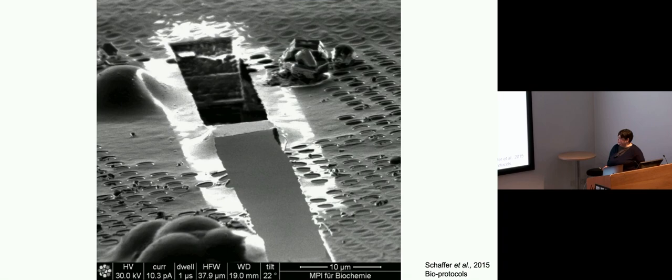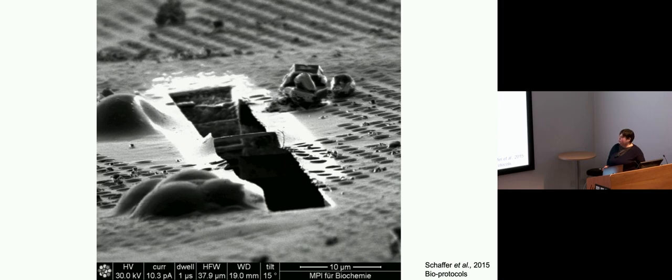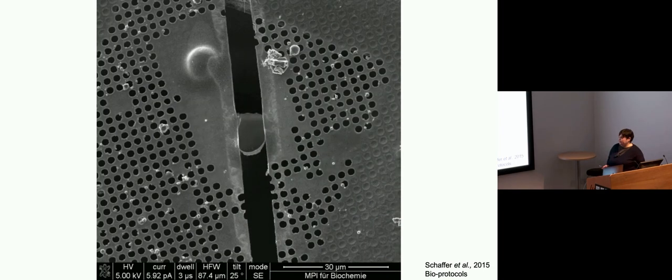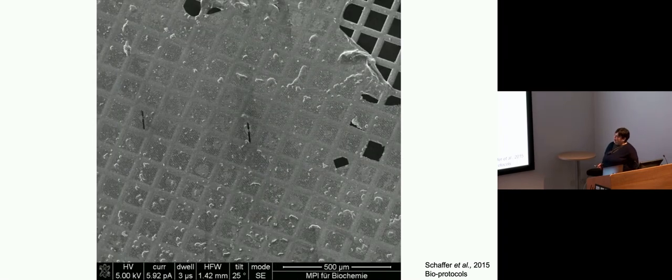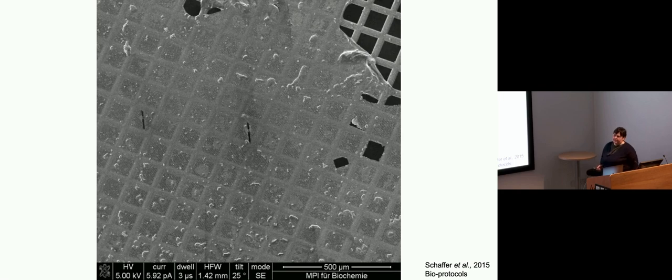There's the lamella. By tilting and rotating the grid, you can see this lamella that's not quite parallel to the grid. It's a little bit of an angle, but a relatively shallow angle. This is what it looks like in the SEM. In this case, there's another one being milled over here on the grid. In an ideal situation, you want to get as many of these on a grid as you can.